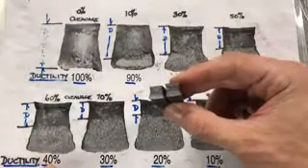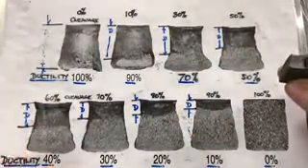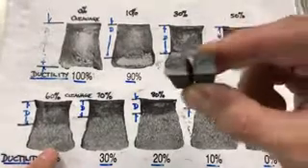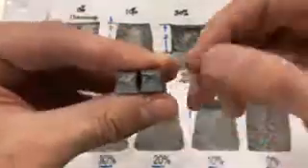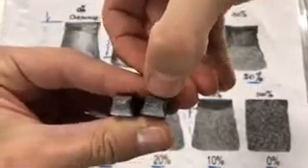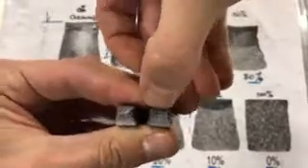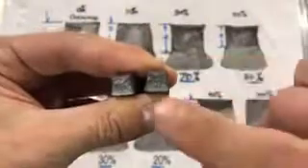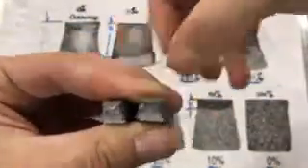So it is around 40% ductility we have here going on, and 60% brittle fracturing. So always start to look at the surface, kind of excluding the notch area. You see this little region, so therefore that would be true. I would say 60% of this brittle fracture and 40% of this ductile fracture.